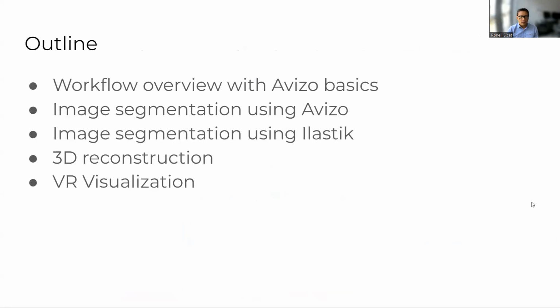Okay. So yeah, our outline for today's workshop is as follows. We're going to start with an overview of the whole workflow from segmentation to reconstruction and visualization. Together with the overview, I will describe some of the basics in Avizo, because we will use Avizo most of the time. So it's important to get the basics down in the beginning.